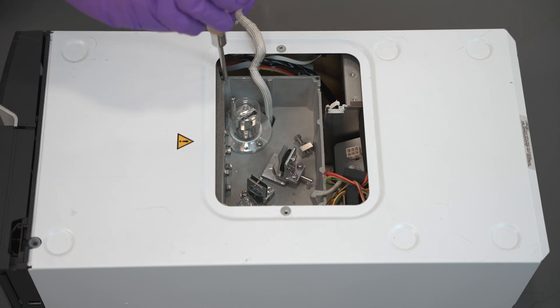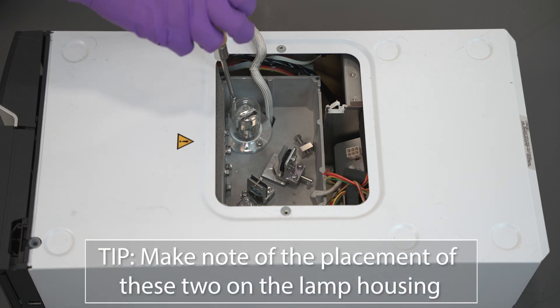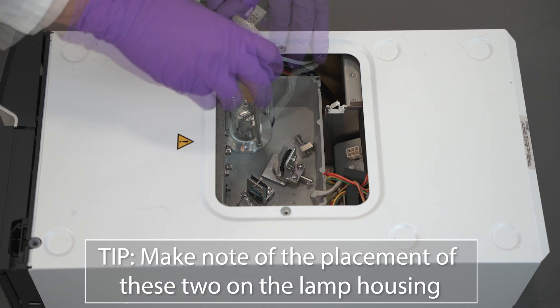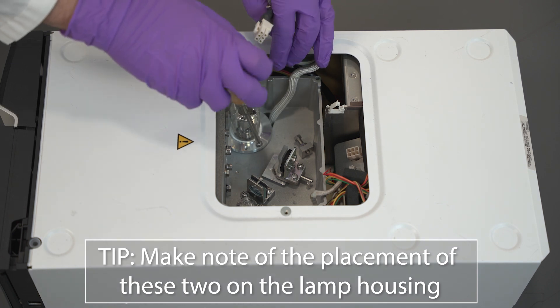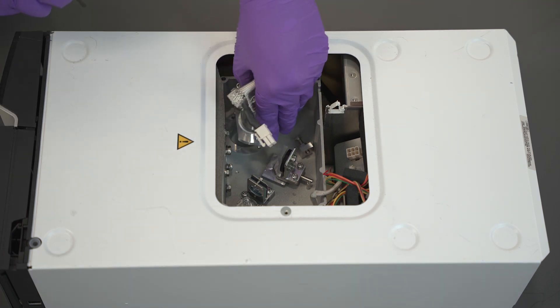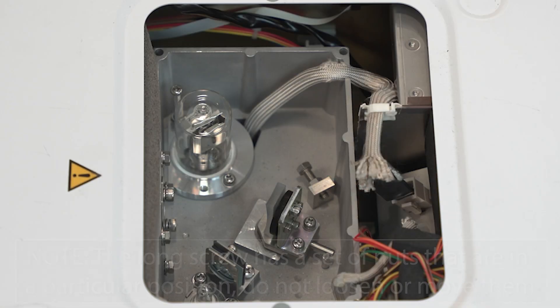Loosen the two deuterium lamp mounting screws with the Phillips head screwdriver until the deuterium lamp can be removed. Make note of the placement of these two screws on the lamp housing. Remove the two screws and set aside for the new lamp. The long screw has a set of nuts that are in a particular position. Do not loosen or remove them.